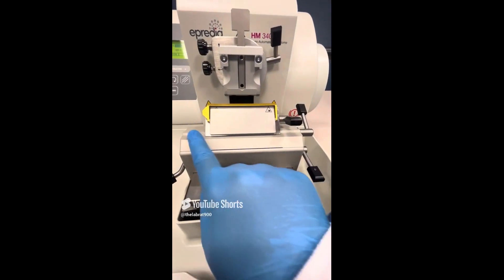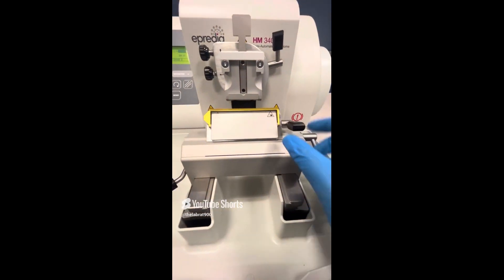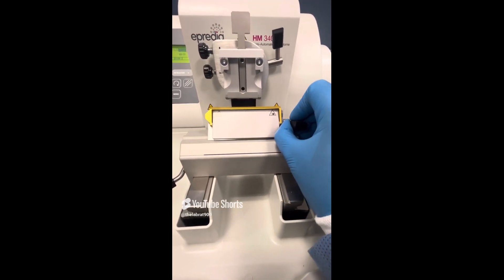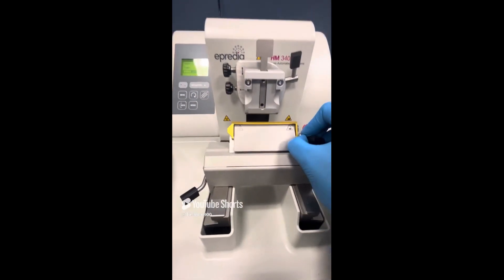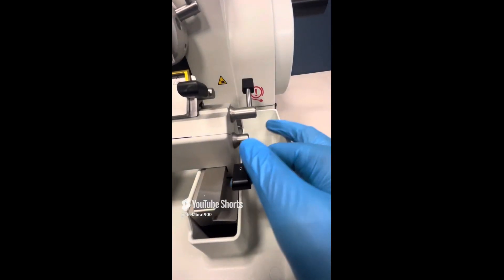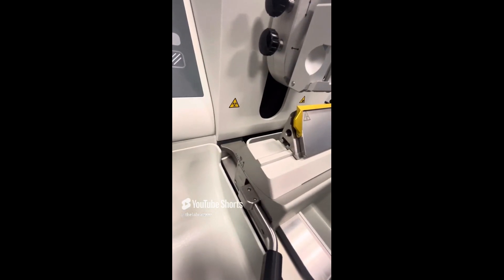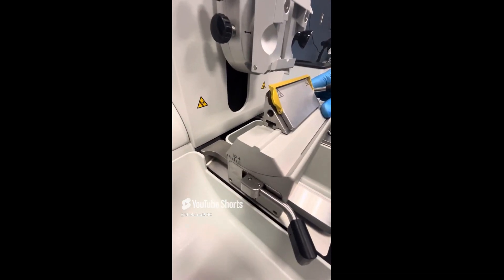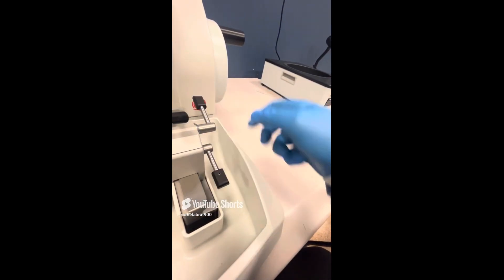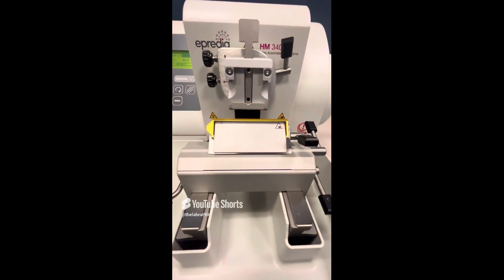If you want to move the clamping plate from side to side, the clamping lever when upwards is locked. When it's downwards, you can actually move the clamping plate. Whenever it is in the spot that you want, move that lever back up to lock it in place. You can also change the clearance angle of the blade by using this lever — when you push it down, this allows movement of the blade. Adjust it to whatever clearance angle you would like, then move this lever back up. That is where your cutting is going to be taking place on that microtome.